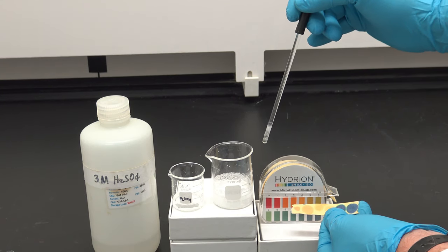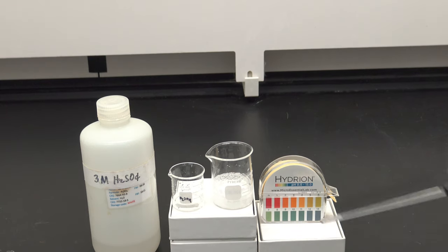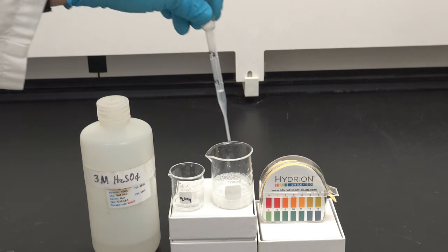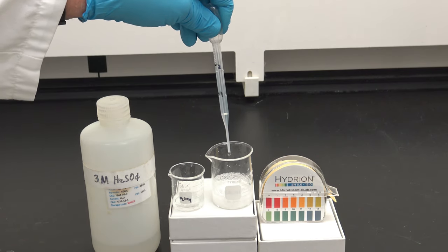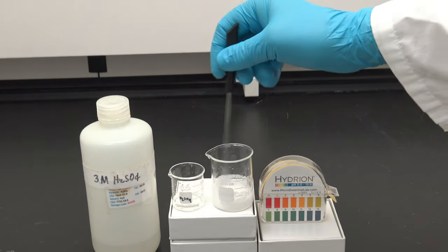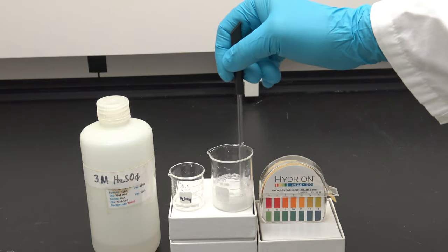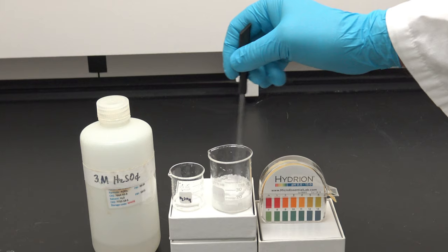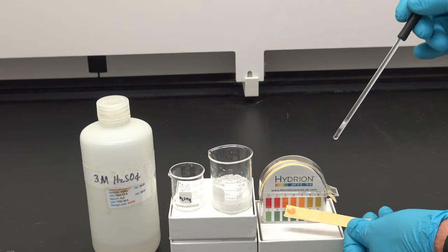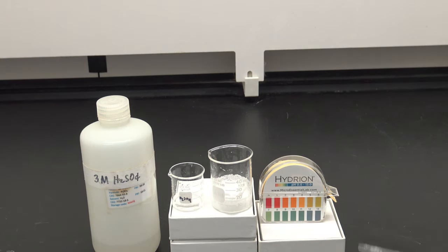We're getting down there near pH around 3. I'm going to add some more sulfuric acid. Stir up the contents of my beaker to get my acid all mixed in and react with the sodium hydroxide. And test my pH again. I'm definitely down there, probably near 3 or 4 now. I'm going to add a little bit more sulfuric acid.